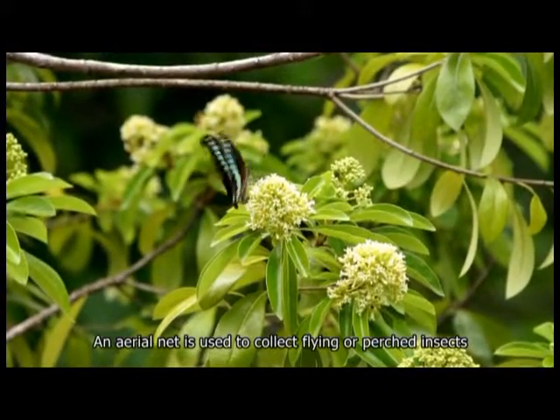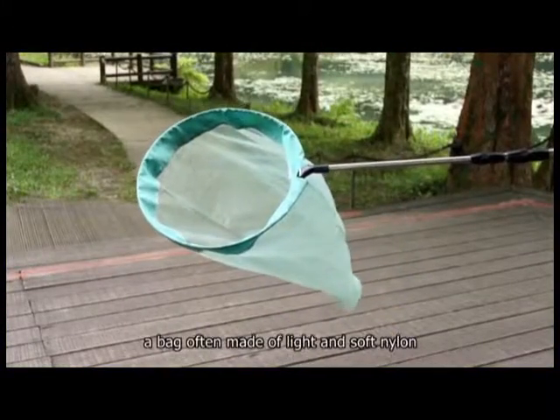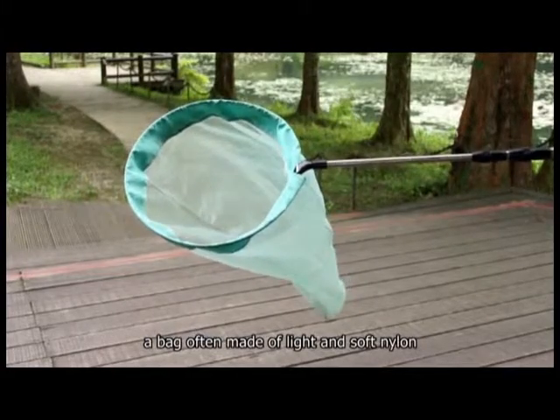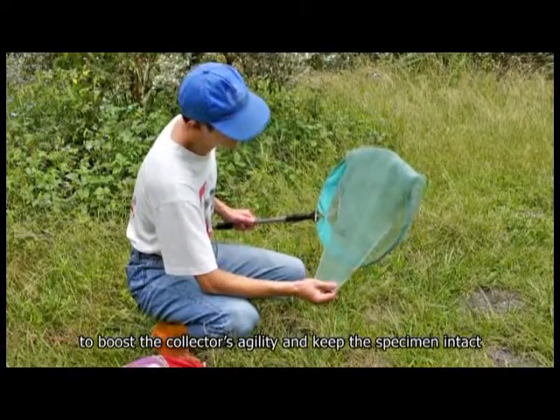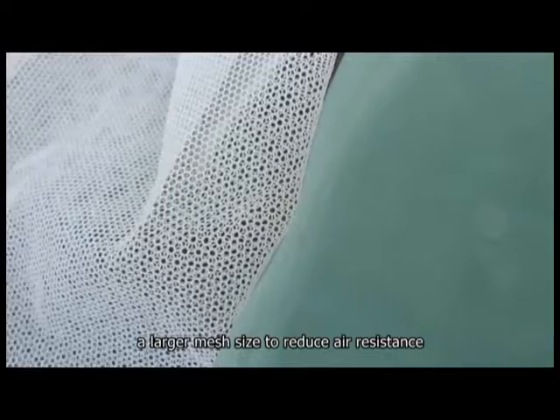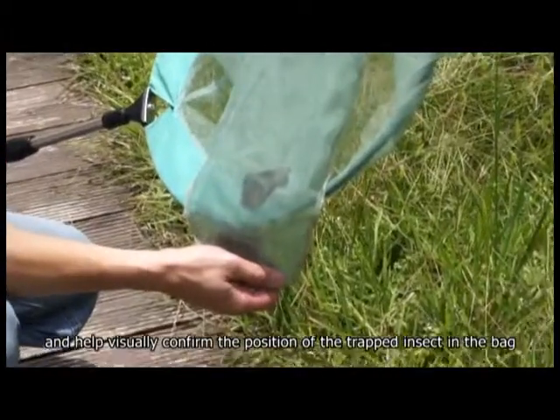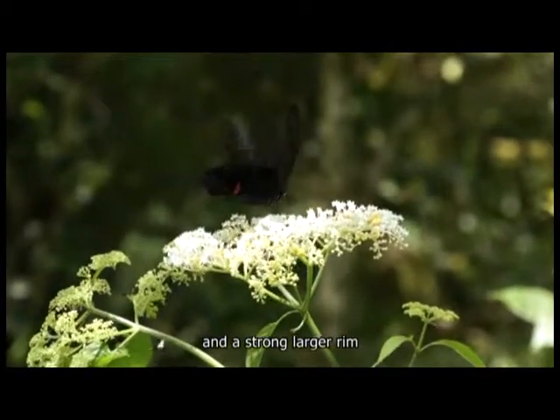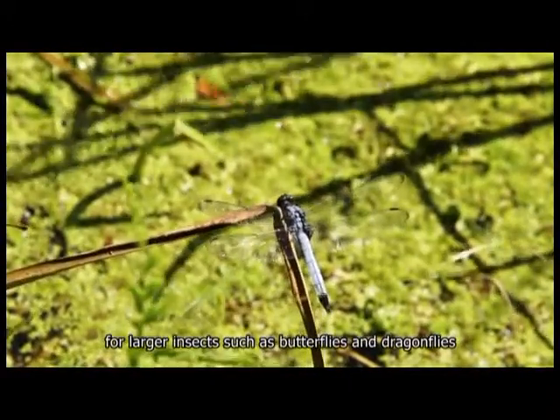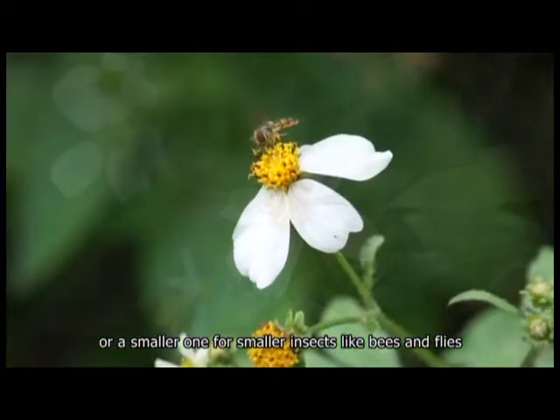An aerial net is used to collect flying or perched insects. It has a relatively light handle and a bag often made of light and soft nylon to boost the collector's agility and keep the specimen intact. A larger mesh size helps reduce air resistance and visually confirm the position of the trapped insect. A stronger, larger rim suits larger insects such as butterflies and dragonflies, while a smaller rim is used for smaller insects like bees and flies.